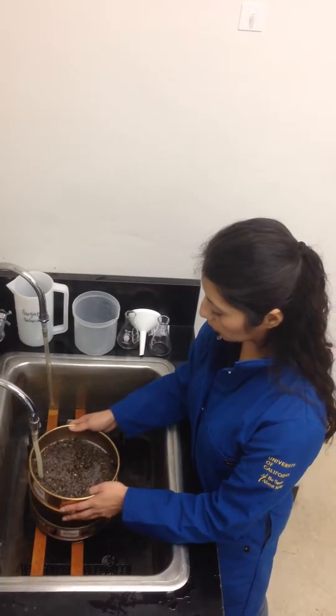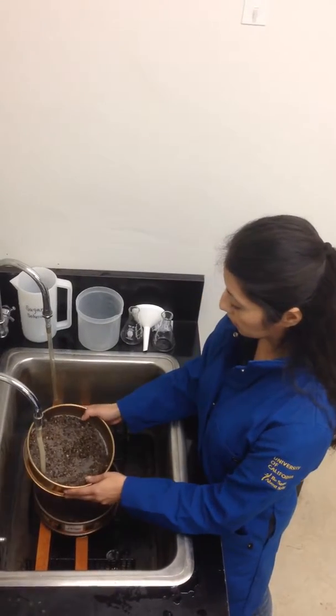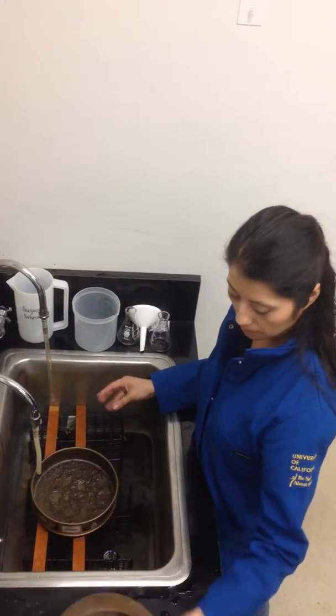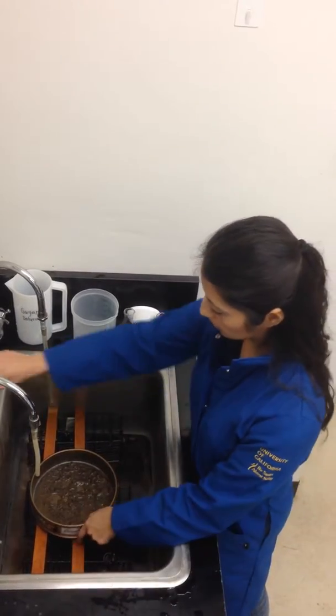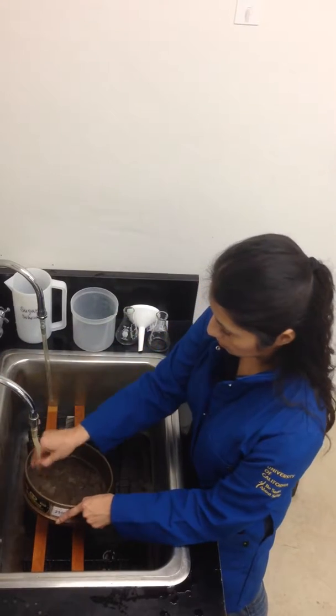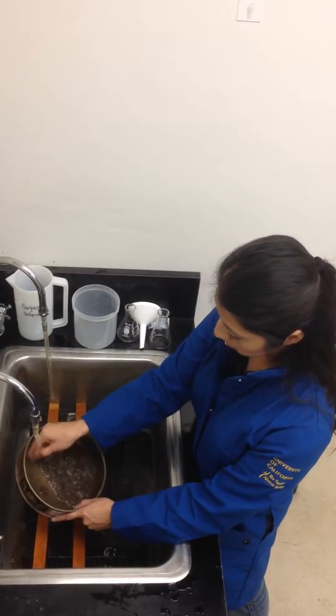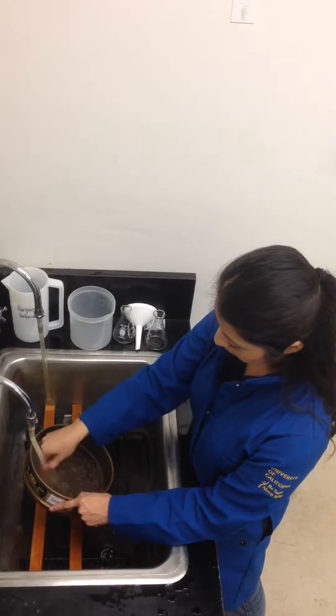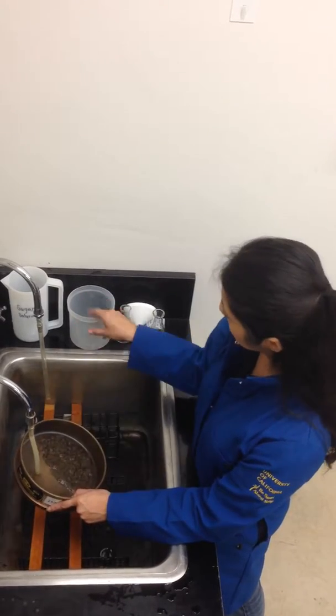After all the soil is washed through the sieve, any remaining rocks or organic matter can be thrown off. Now we're going to wash the soil that is on the fine sieve into an open container.